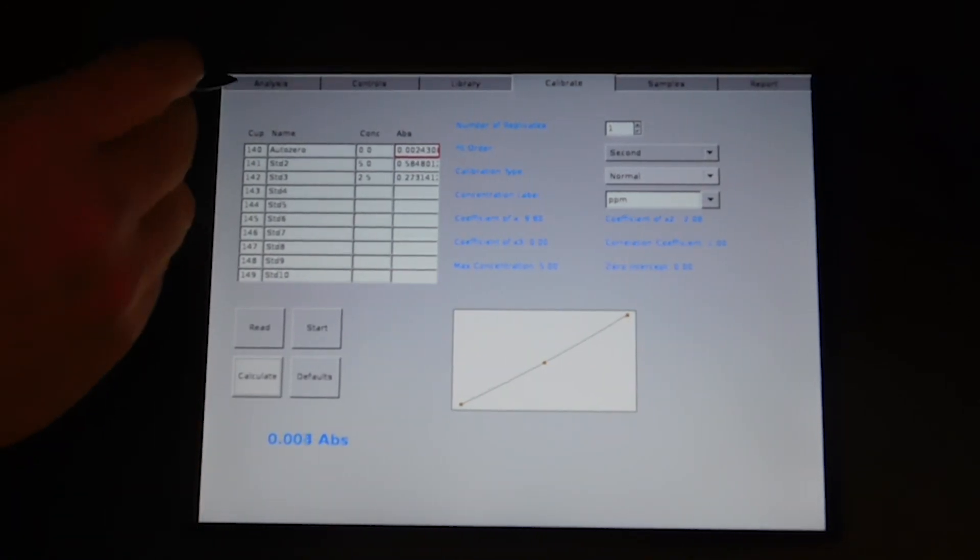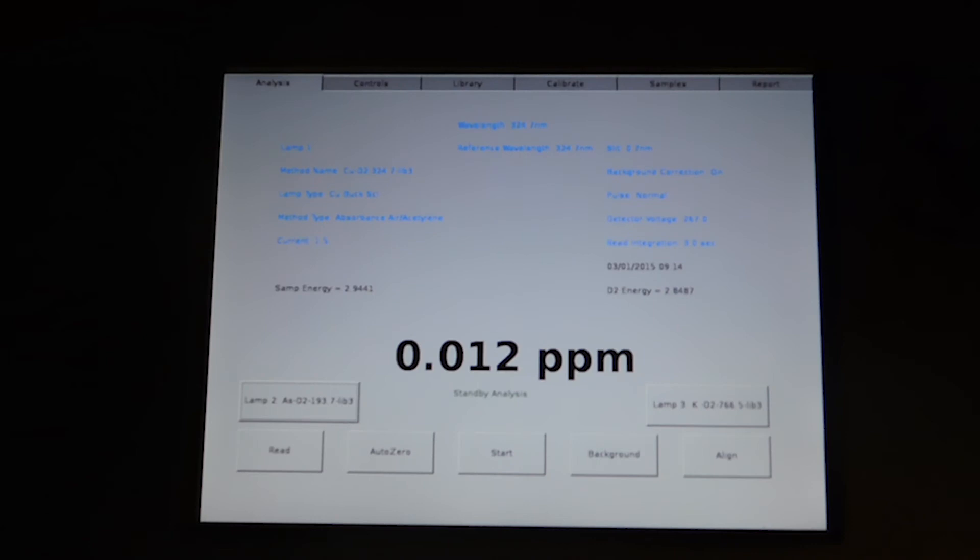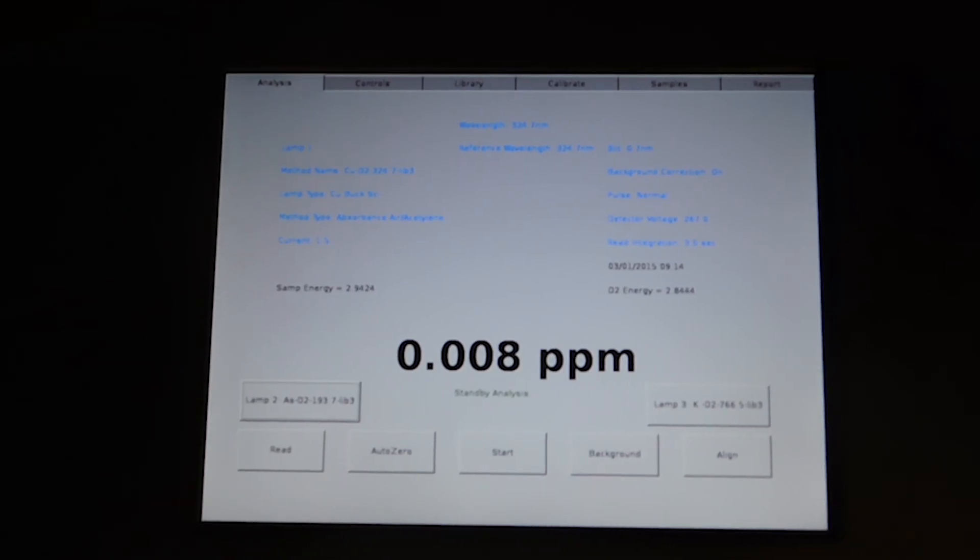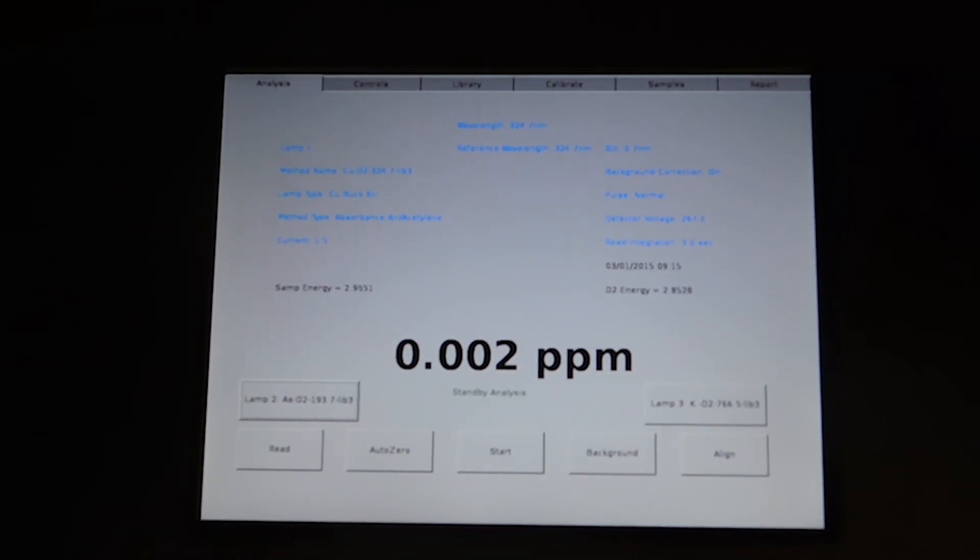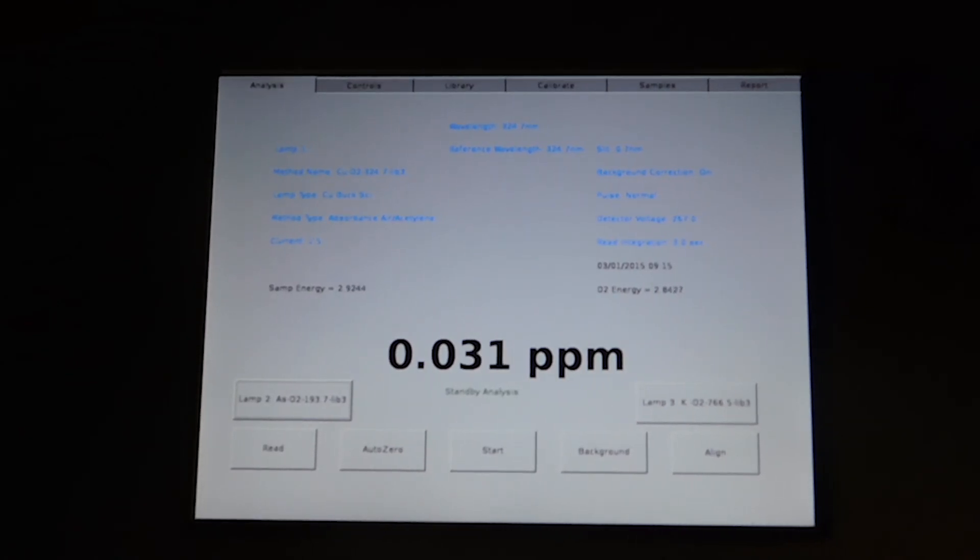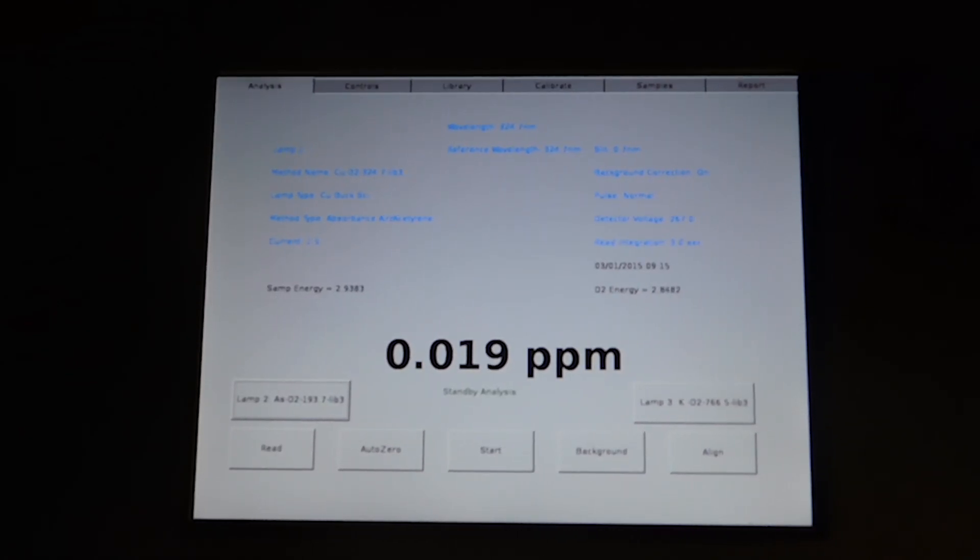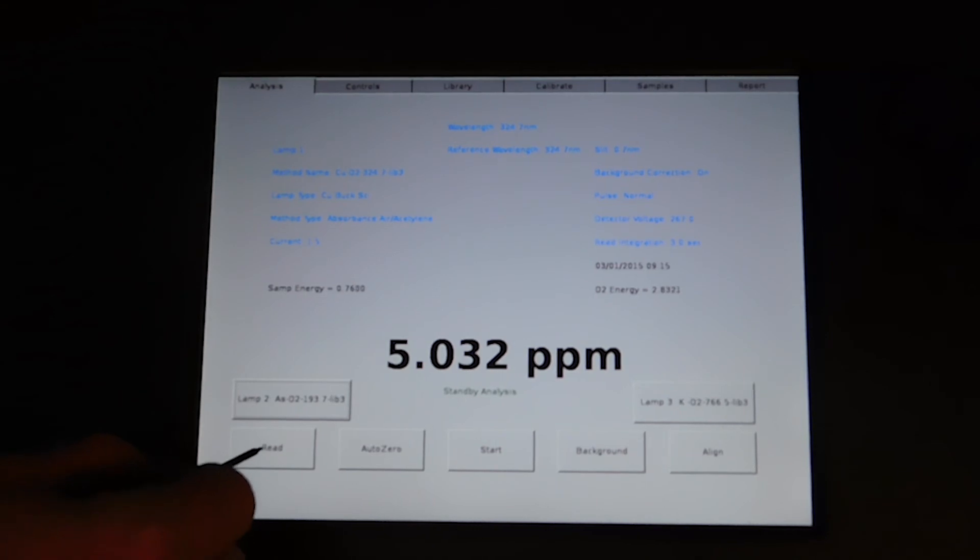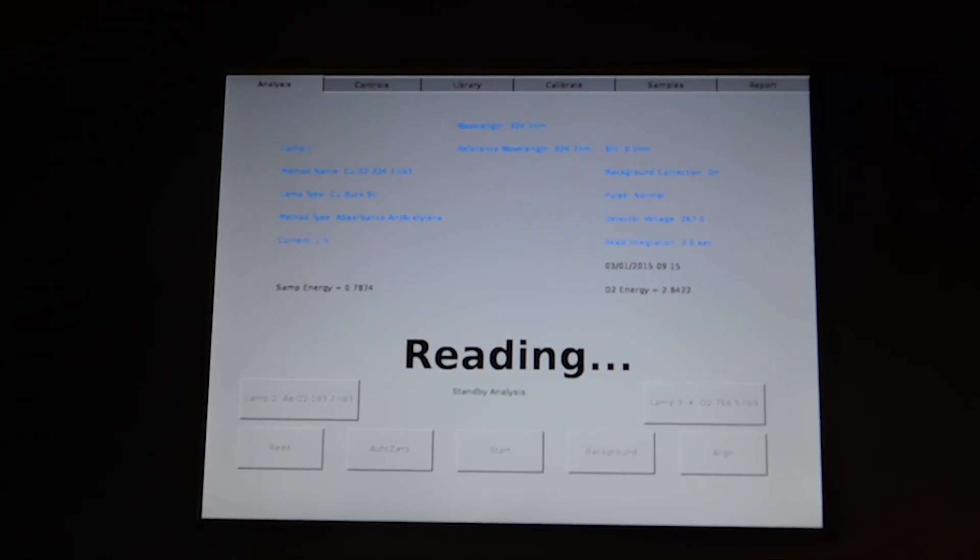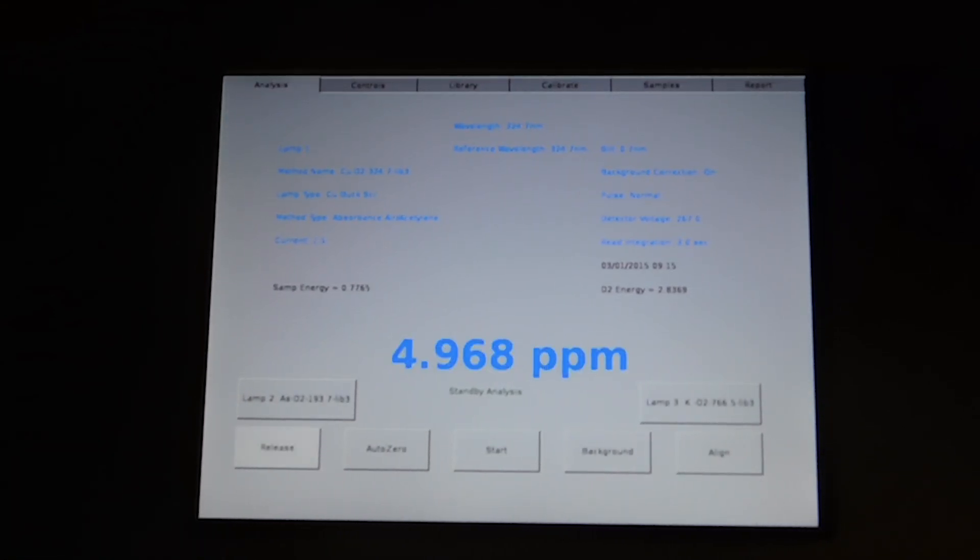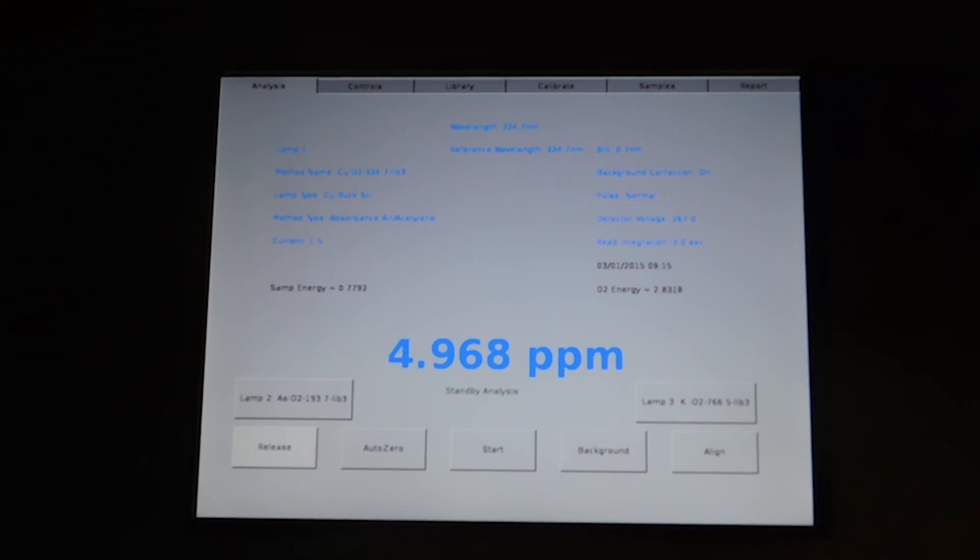Now when you go into your analysis screen, your readouts are now in parts per million. If we run a sample, and I'll use the five part per million as a sample, you can read your sample as a five part per million.